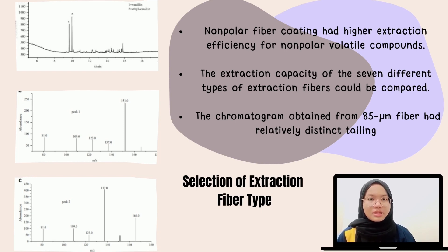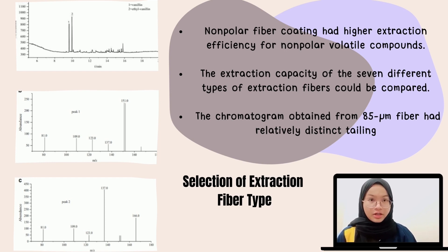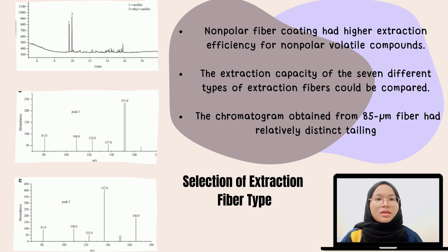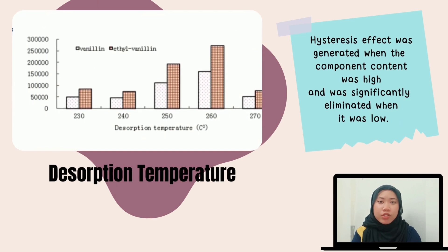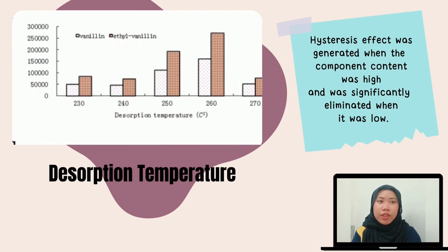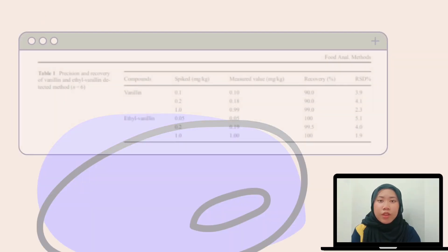Under these conditions, the extraction effects of 7 different types of extraction fibers on a matrix standard solution were tested and the results are shown. The extraction capacity of the 7 different fiber types was compared according to the amount of extracted vanillin and ethyl vanillin, chromatographic peak resolution, and peak shape. The analytes obtained from the 7 fiber types were well separated. However, the chromatogram obtained from one fiber type had relatively distinct tailing, mainly because that extraction fiber had strong absorbability to the tested components. During desorption, a hysteresis effect was generated when the component content was high and was significantly eliminated when it was low.